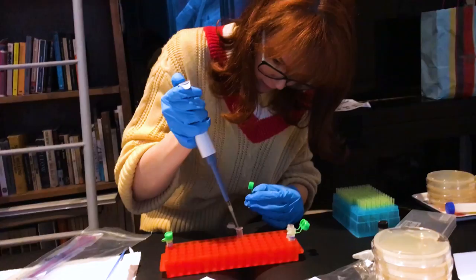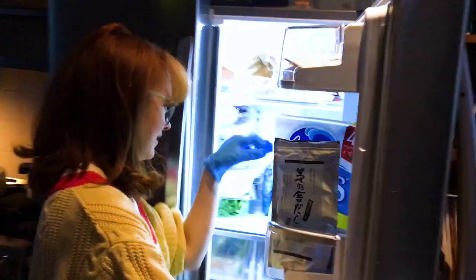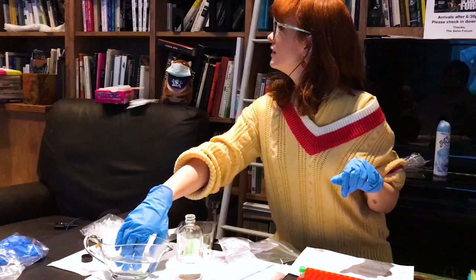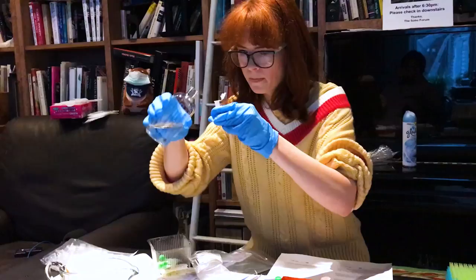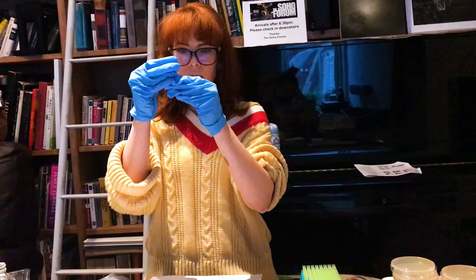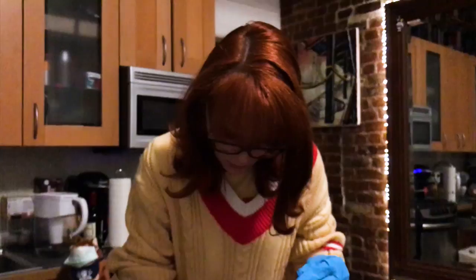Now the CRISPR. Adding the CRISPR components to the competent or weakened-walled bacteria is called the transformation process. You put the CRISPR materials into synthetic DNA and trick the bacteria into thinking that this synthetic DNA is its own DNA.